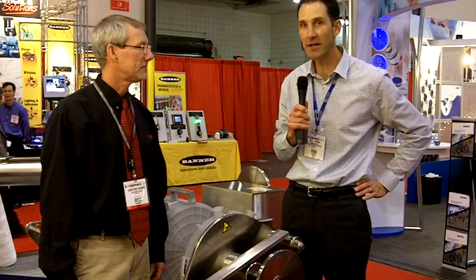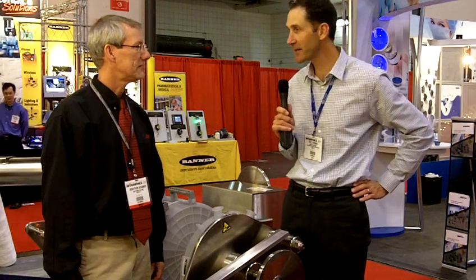Hi, it's Paul Thomas with Pharmaceutical Manufacturing at Interfex 2011 in New York City, talking today with John Kramer of 3M Purification. Thanks for being with us. Thanks for having us, Paul.